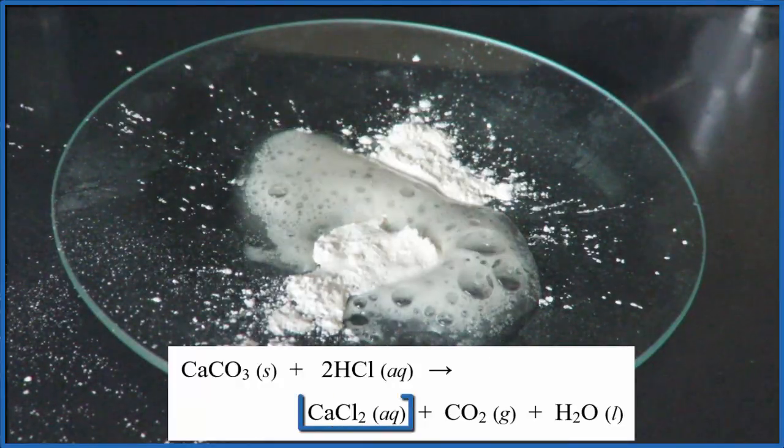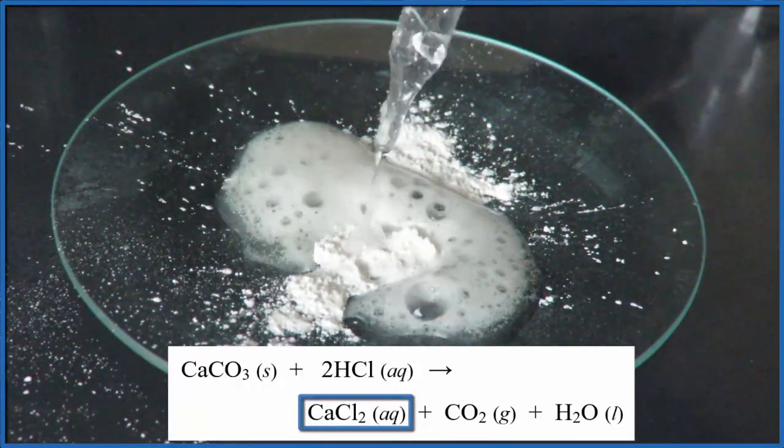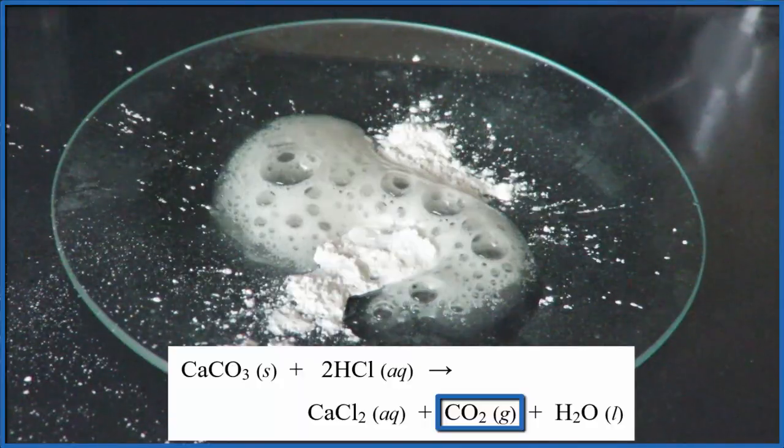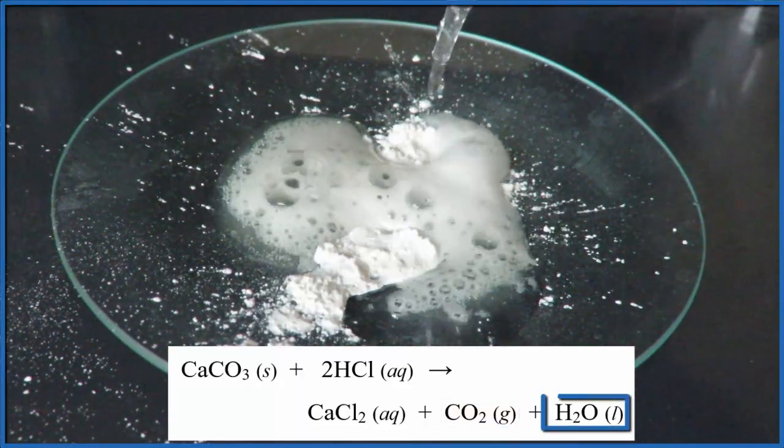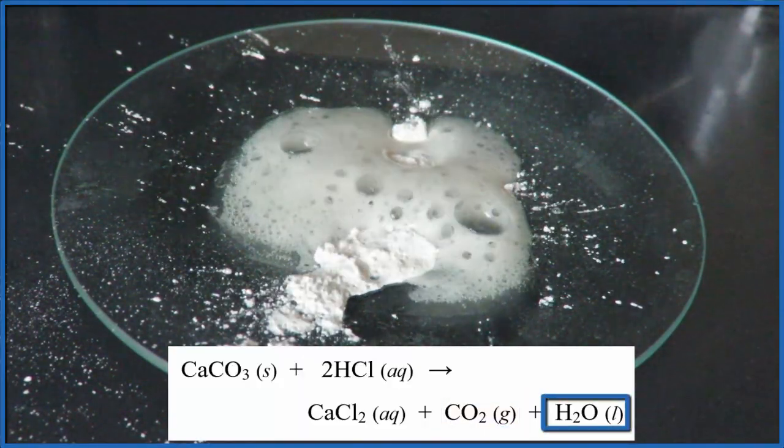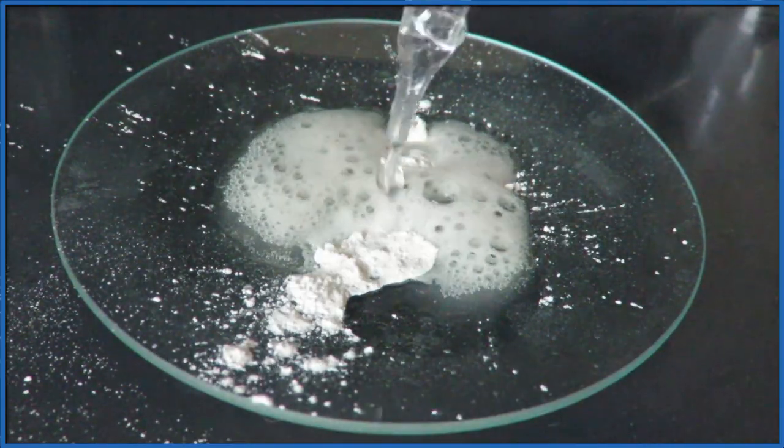We get calcium chloride, that's dissolved in the liquid, and carbon dioxide gas, those are the bubbles you're seeing, and then some water. So this is the equation for the reaction of calcium carbonate with hydrochloric acid.